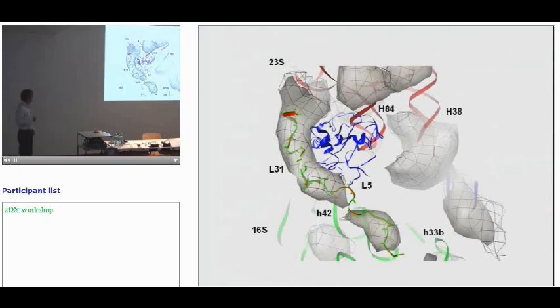difference density. And indeed, analyzing the difference between those two ribosome structures, where the E. coli map lacks parts in the models as compared to the Thermophilus structure, indeed, all the differences that we could observe could be explained in this way here. So this was my last slide for this short presentation.